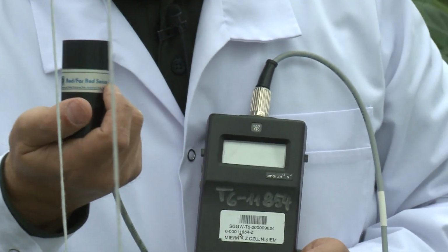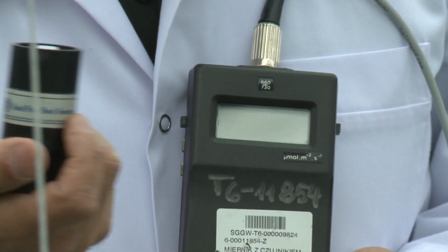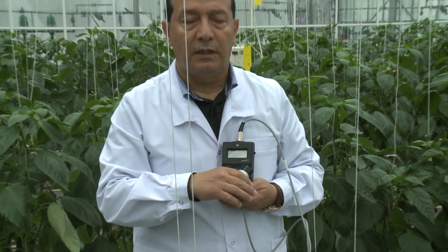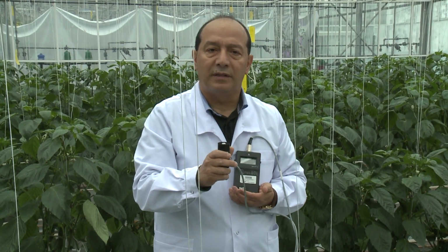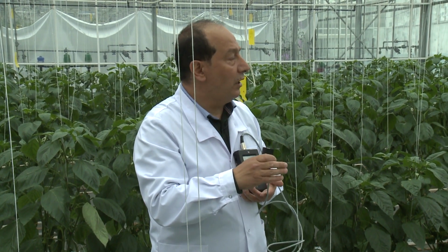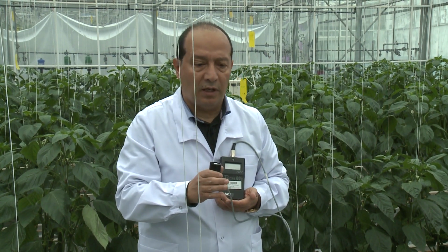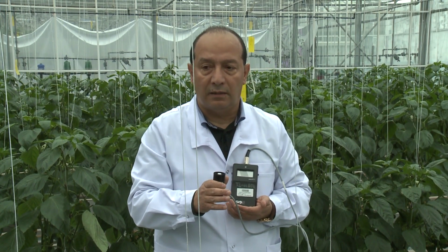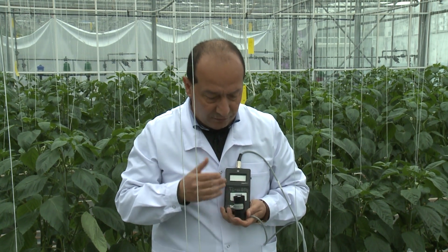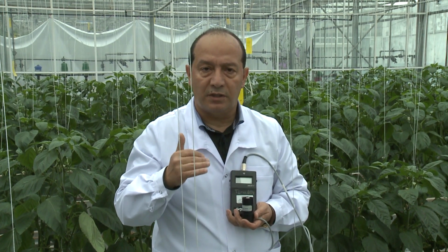This ratio is very important for any plant growers in greenhouses or in controlled environments, because in nature, this ratio should be about 1. So if we built our greenhouse with foil or glass and we added some LEDs or any other sources of light, like halogen lamps or others, we would like to check if this ratio stays at the same level, which is about 1.